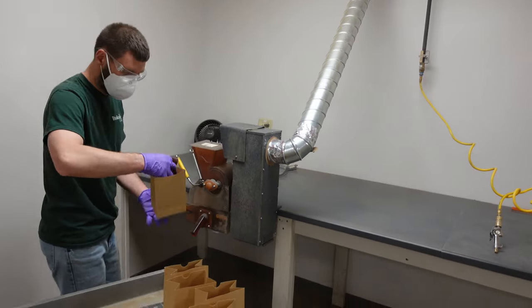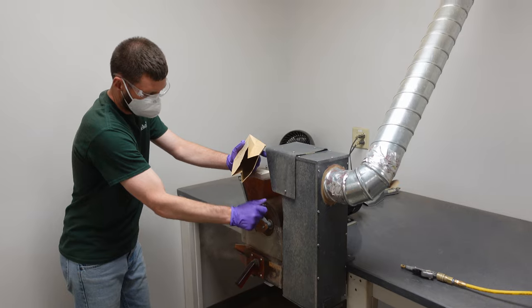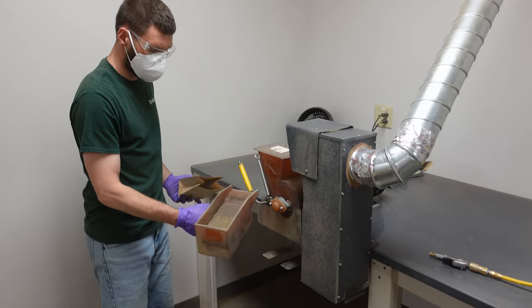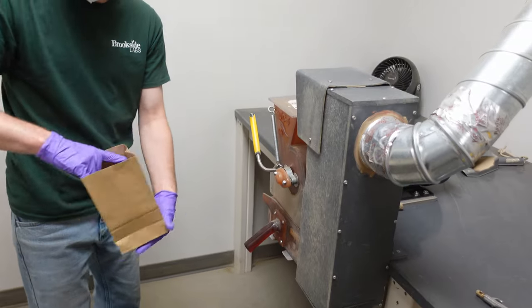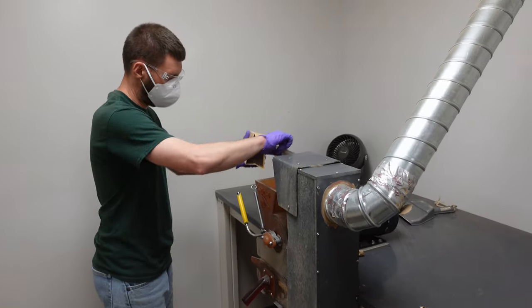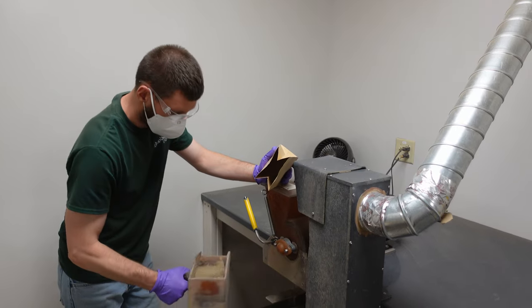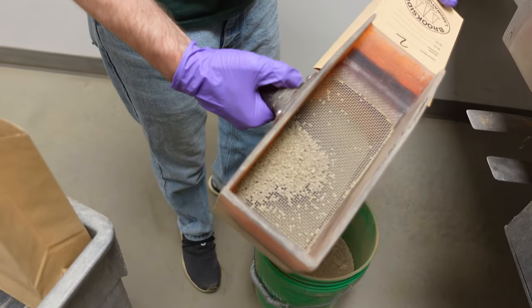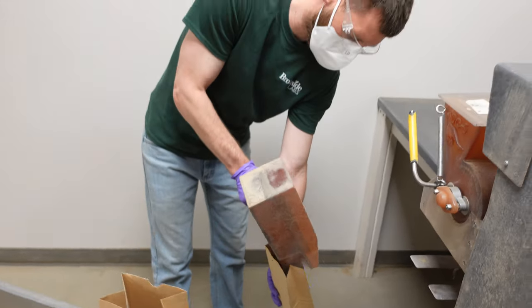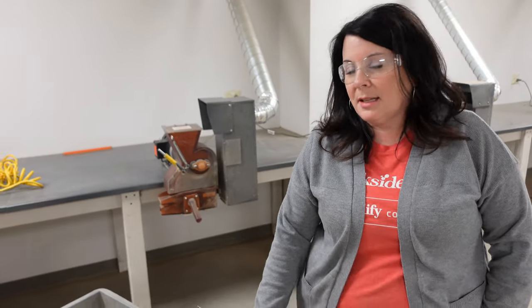The grinding is done to homogenize the samples and also to remove any material that is not soil. The soil needs to have any undecomposed living and dead plant material removed. Any gravel and rocks won't be included — stems, sticks, pieces of gravel, stuff like that will get removed during the grinding process. You get these bigger chunks of material that are bigger than a piece of sand. As the samples have been ground and sieved to two millimeters, they're taken to the scheduling table where the samples are scheduled into our LIMS system and assigned a lab number.